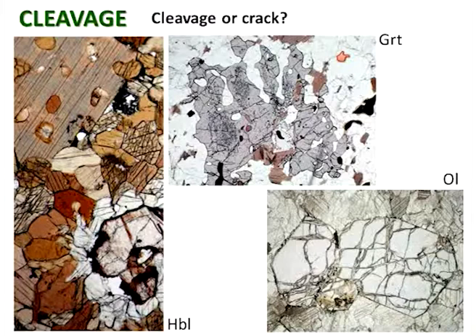Let's move on to this one, to the garnet. What do we have here? Do we have cracks or do we have cleavage?